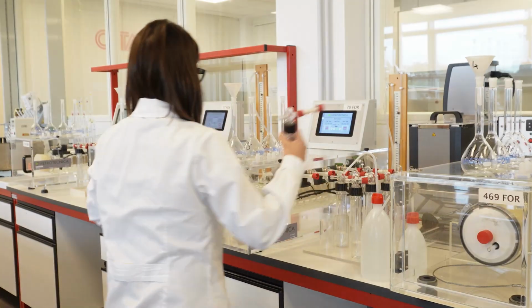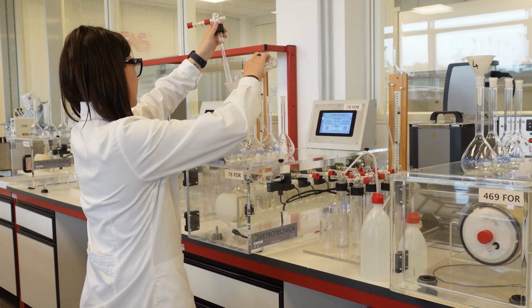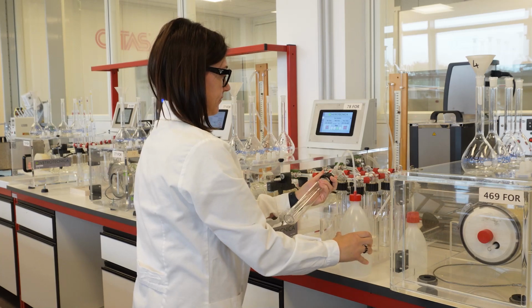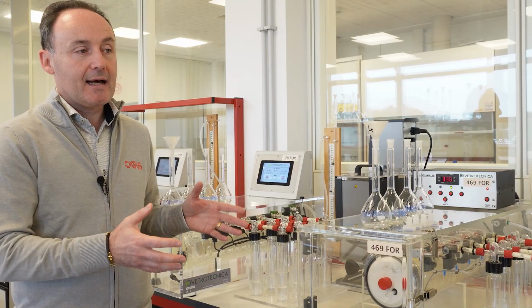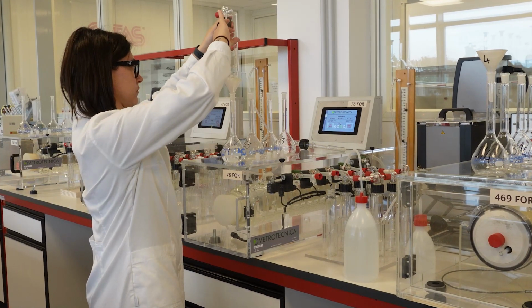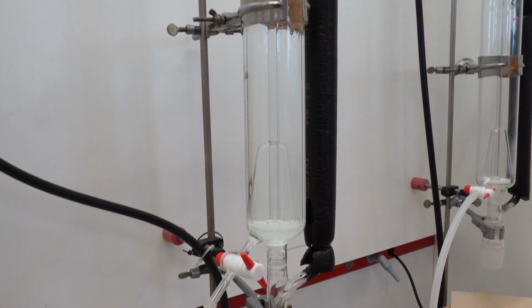A practical example is this type of equipment that we use. This is a gas analyzer. It is regulated by a specific international standard, and we use it to run a test that allows us, within 4 hours, to determine whether timber panels are compliant with the Italian ministerial decree as well as with the European legislation. We can therefore ensure that the timber panel is compliant with the strictest market rules at the moment.